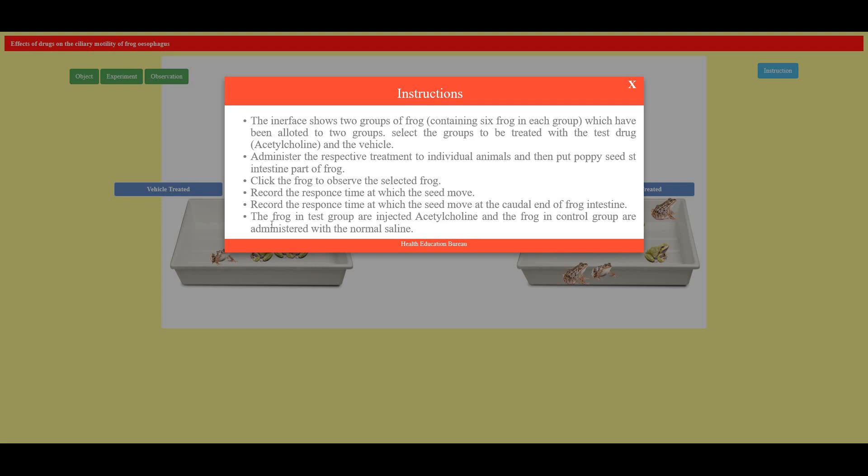Record the response time at which the seed moves at the caudal end of the frog intestine. The frog in the test group are injected with acetylcholine and the frog in the control group are administered with normal saline. So here are the main four key points: two groups of frog each containing six, one is test drug acetylcholine and next is the vehicle that is administered in both the two groups of the frog.